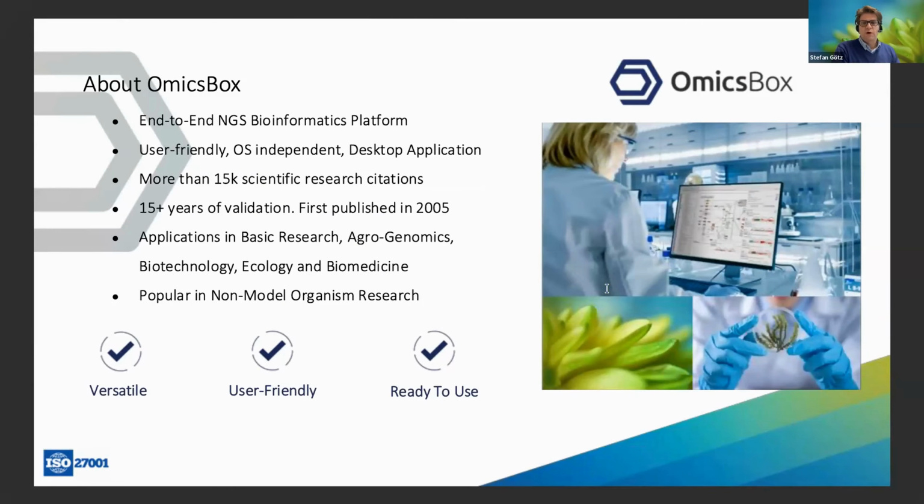Okay, so our main product is called OmicsBox. I guess quite a few of you are already familiar with BioBam and OmicsBox, so I'll keep this short. OmicsBox is an end-to-end NGS bioinformatics platform. You can put all the raw data formats you're getting from the different sequencing technologies, short reads, long reads, single cells, those kinds of things, into the platform, and then you can pick the modules we have in OmicsBox and run through those different scenarios to get to the end, which is your biological interpretation, biological insights, to make sense out of your research, right?